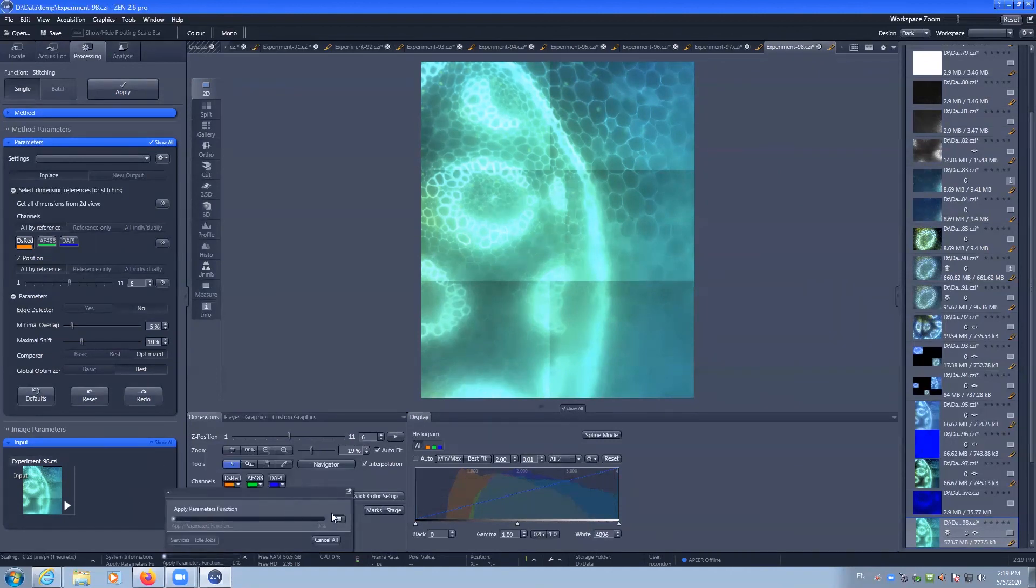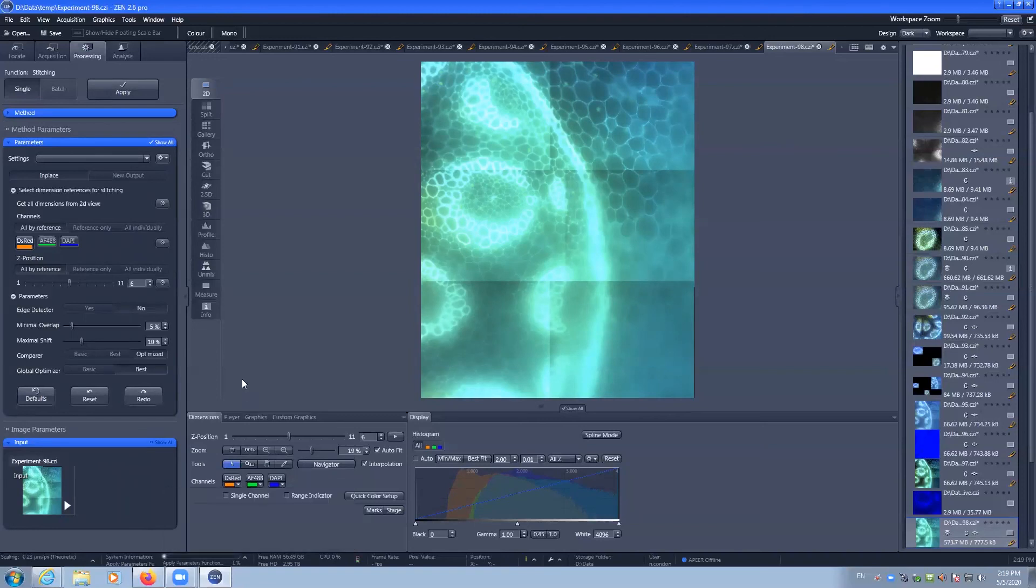We can see that the task is trying to do that alignment. It'll take a little bit for a multi-channel six positions Z stack. 11 Z stacks and six positions does take up some computational resources.